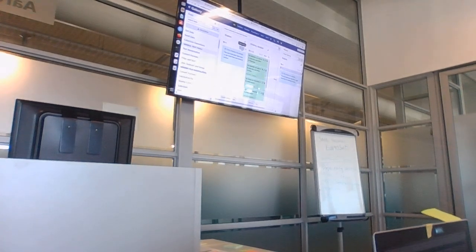Okay. This one and drop down. Yeah, so you've got this one good. You need to put in one history for the cholera. Yeah, this is the cholera data set. Okay, change.